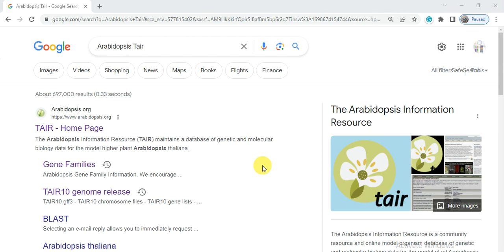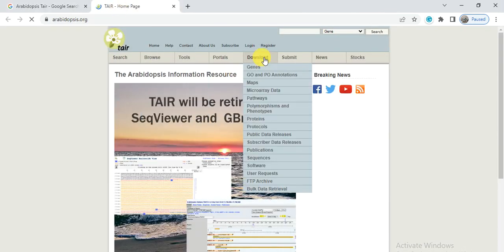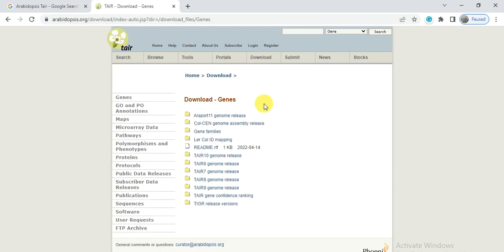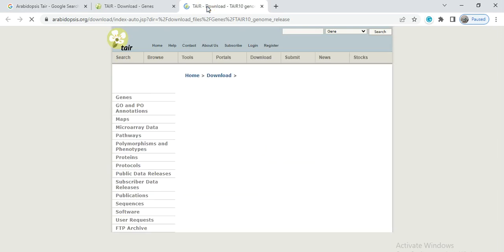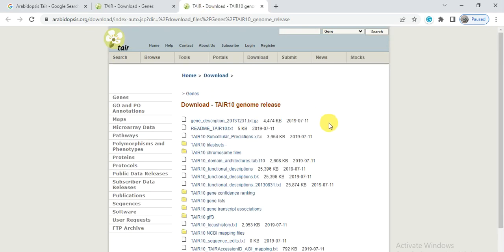First, we try to find the query protein from Arabidopsis. Open Google and search for Arabidopsis TAIR, then open the first link. Go to the Download section, right-click on Gene, and use the TAIR10 genome. From here we will download some files — one is the gene description file.